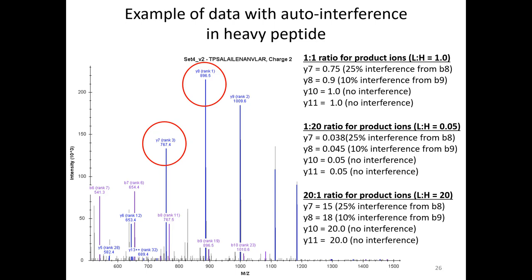So I think there's only a problem when you use your internal standard actually as a standard, right? It could be, or if you have a calibration curve that qualifies the standard, then you have a problem with it. But what if you have another one of your peptides interfering with another target? Like this is for auto-interference, true, but there could be other things that could cause similar interference responses. And so in general practice, it's not a bad idea to set this up.